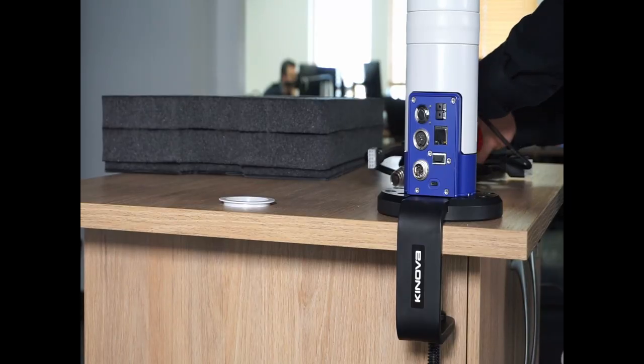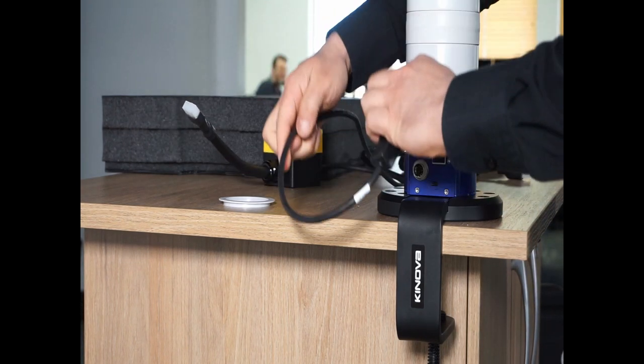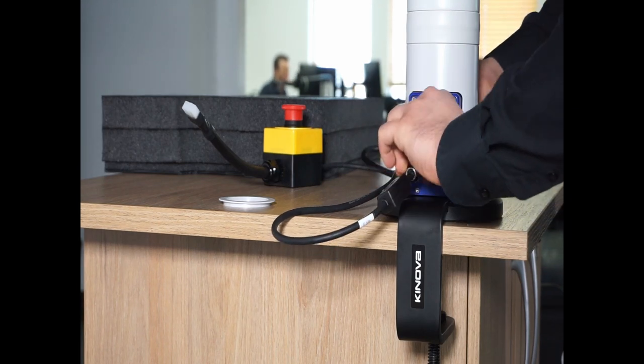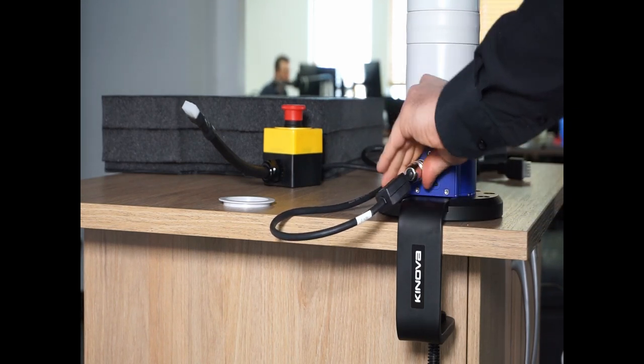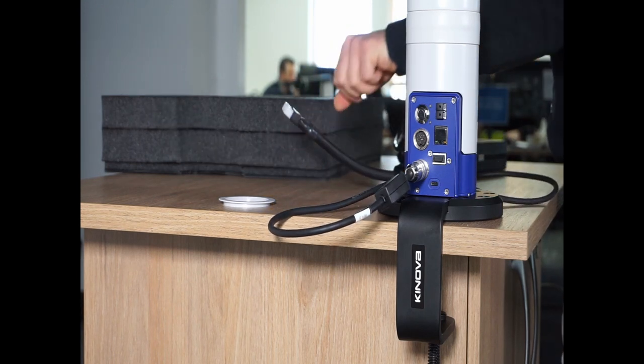To power on the robot, you first need to connect the emergency stop to the base controller. Then, connect the emergency stop and the power supply together.